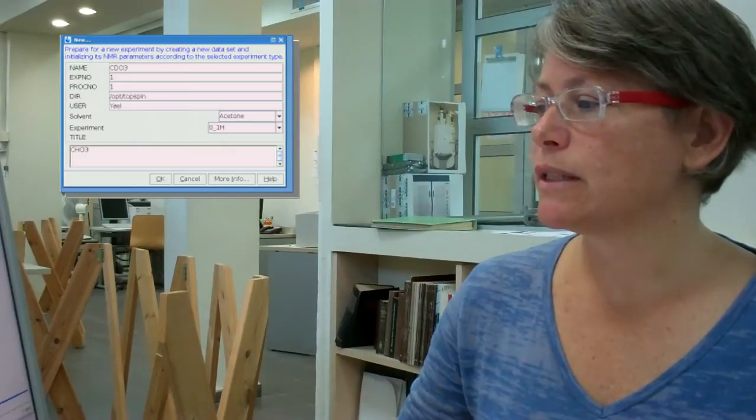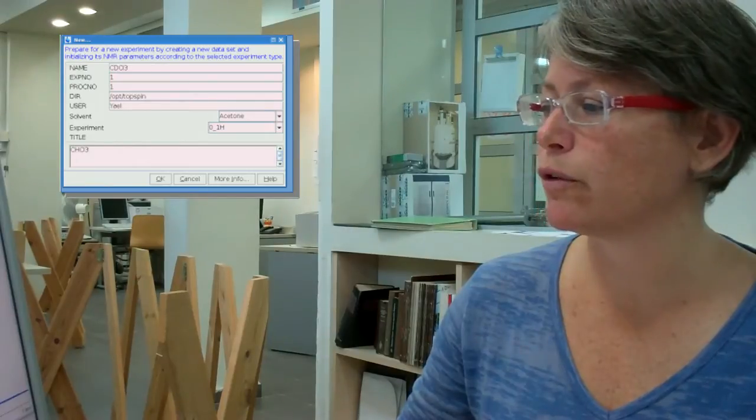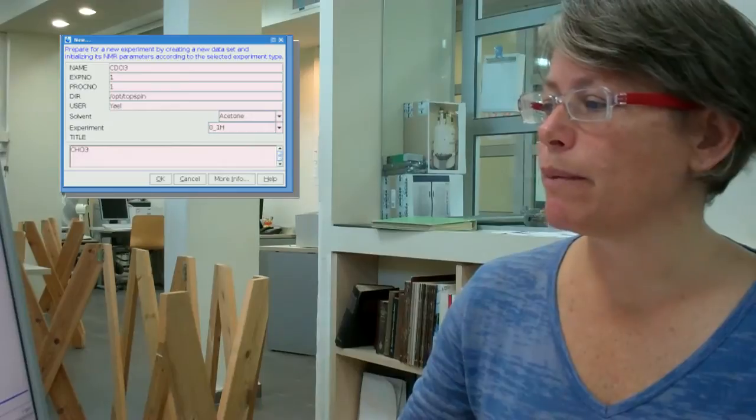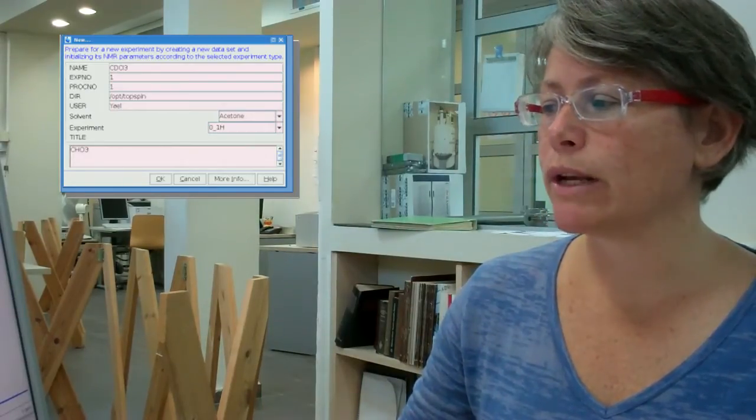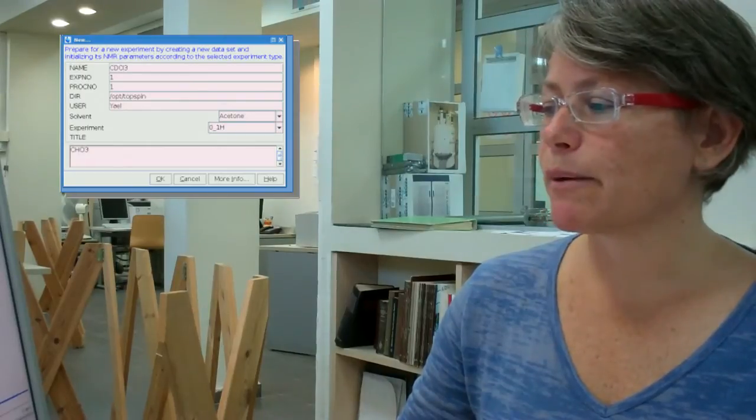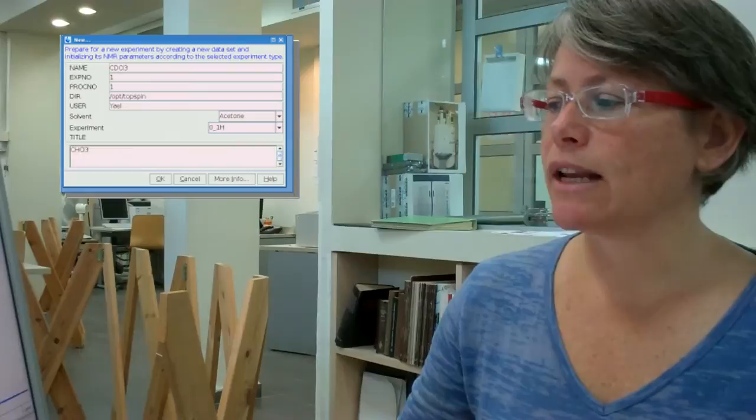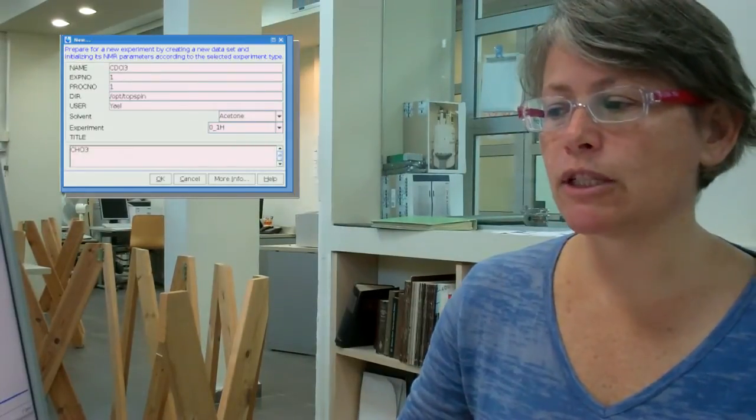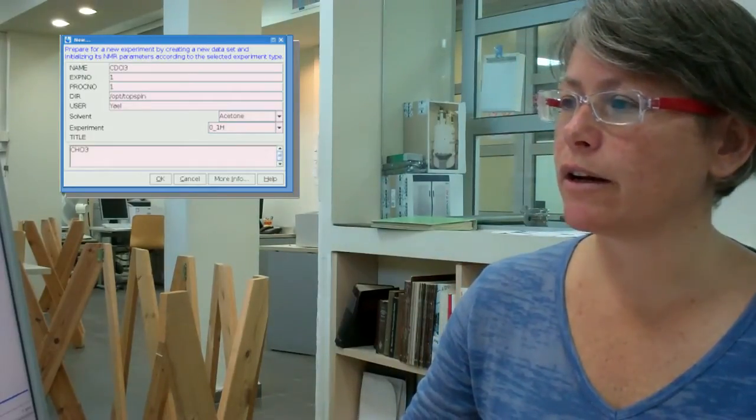For solvent, I'll here choose what solvent I'm going to use. I've got a sample with deuterated chloroform, and so I select CDCL3. For experiment, I'm going to scroll down and choose 0_1H. That's the same exact parameter set as this one that's written just 1H, just that it's higher up on the list because of the 0. For title, I'll type in the title of the material that I'm going to use, and then I'll click on OK.